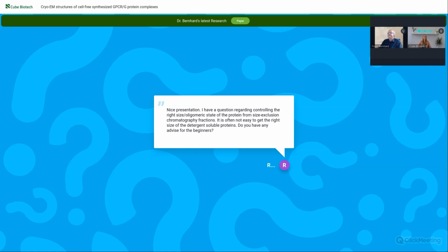Then coming to the next question. First, he thanked you for your nice presentation. The question is regarding controlling the right size and oligomeric state of the protein from size-exclusion chromatography fractions. It is often not easy to get the right size of the detergent-soluble proteins. Do you have any advice for beginners?